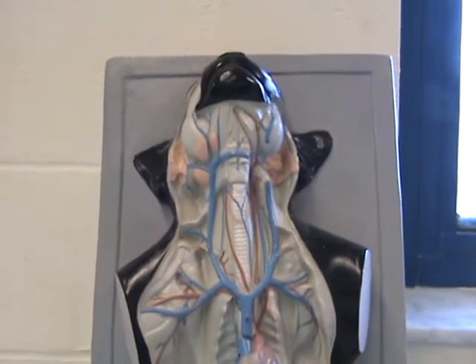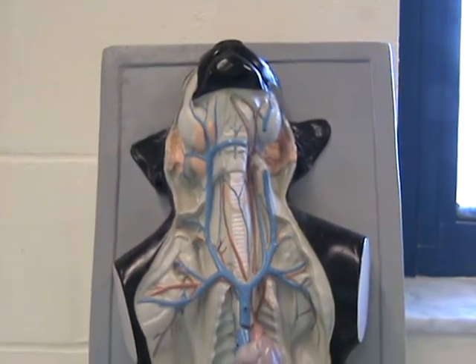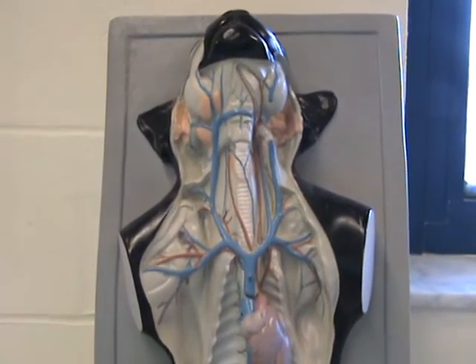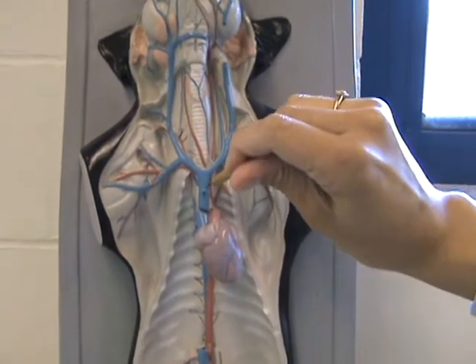This is the cardiovascular tour of the kitty. And here we go. The first one is the superior vena cava, right there.